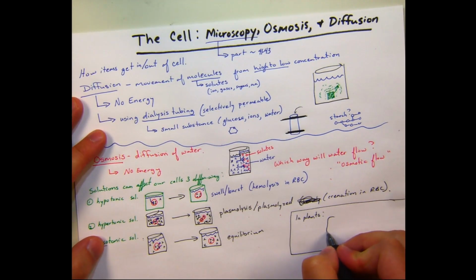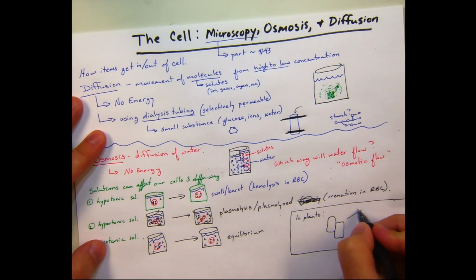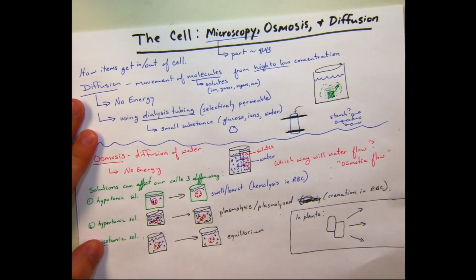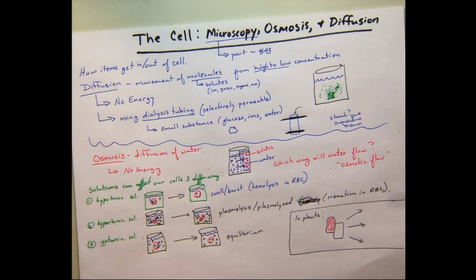These little squares are the cell walls. Inside the cell wall, that onion, it's more of a red onion. All right, so I'll be using the red color here. Inside the cell, there's plenty of pigments, which gives it that red color.